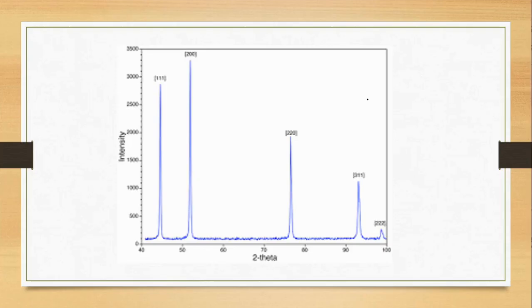I don't quite understand this question here. It says, do I prefer solid or powder diffraction? I'm not sure what you're expecting out of this one. It depends on the substance. It depends on what I have. But from my past, I've only used powder diffraction. I've not used this single crystal one before.